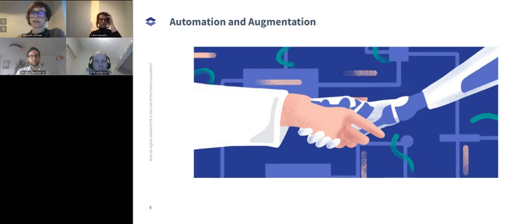And once that is fine-tuned and all observations and settings are noted and recorded, the automation engineer now needs to teach the rest of the team, or the rest of the lab, how to use that robot and that protocol now being fully automated. So in addition to some of the comments made by my colleagues, I would say that an enabler of automation islands is also another way we see our customers leverage assistants today.